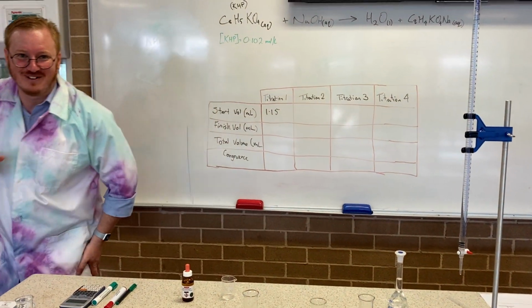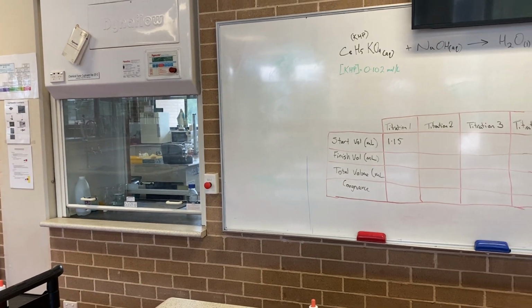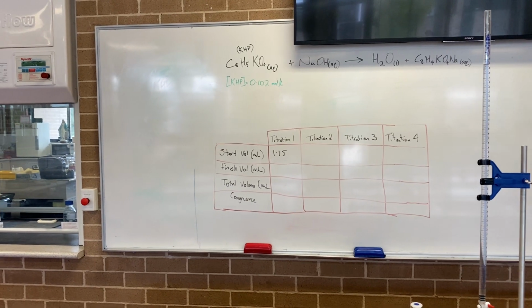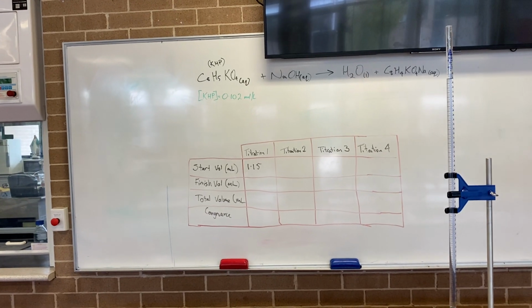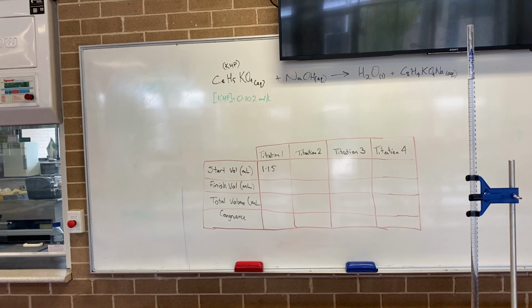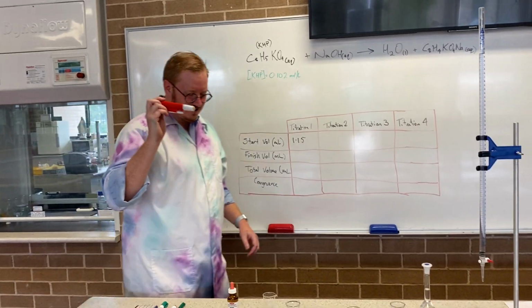And I'll just get a pipette bowl. How professional. Where have they gone? Oh, the pipette bowl. Oh, they're already there, aren't they? And I thought I was ready. What an amateur. Alright.